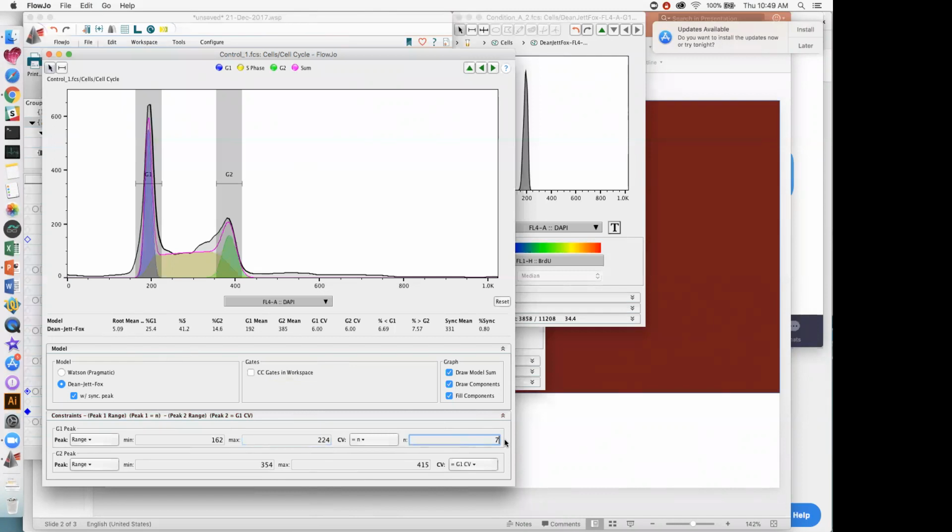And then again, as I said, it's really more or less personal taste here. If we're at 7, we get 3.9. If we are at 8, we go up 0.1 units. So the change in the RMS is not that huge between 7 and 8. But you are correct, we could say that technically 7 is a better number because this RMS is minimal when I set it to that value. Okay, but again, at that point where the variance is very tiny when I make these changes, it's more or less a matter of personal taste.